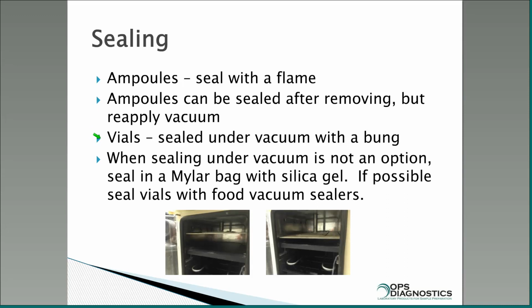So down here in the bottom is the shelf dryer, and there's a stop ring mechanism that's hooked up to a piston. So in this shelf there would be your vials, the bungs would be in there, and I simply hook it up to a pressure tank and push this panel down, this stop ring mechanism down, and push the stoppers into the vials, and then I can release the vacuum.